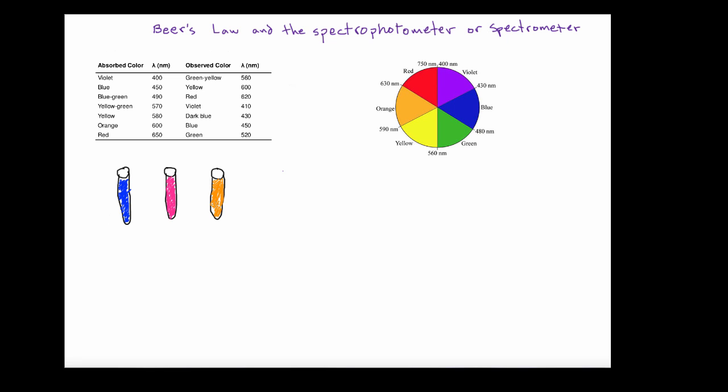So we have these three test tubes, and the iron three is going to be fairly orange, yellow and orange. I'll add some yellow to this to make it sort of a yellowish-orange solution. Now, the one on the far left is my copper sulfate, this one here is going to be the cobalt chloride, and then my last one is iron three chloride.